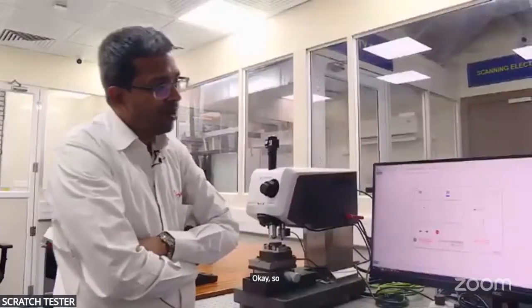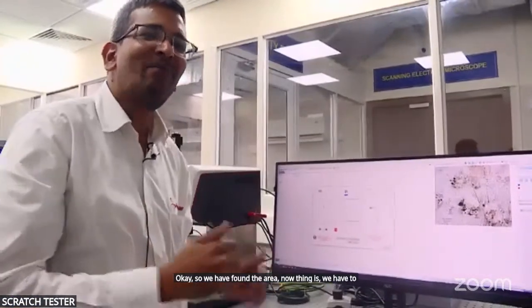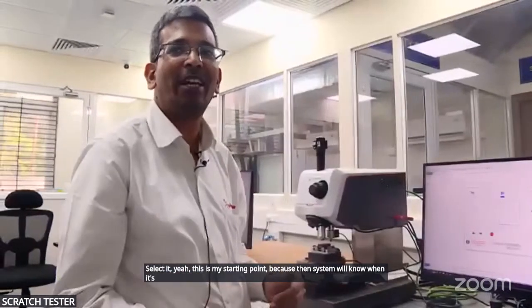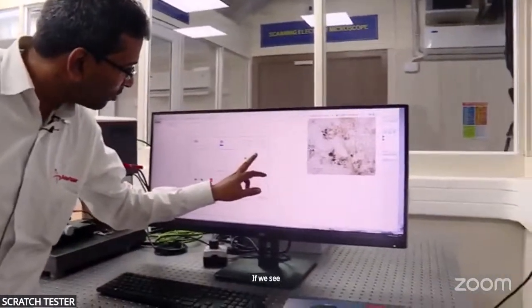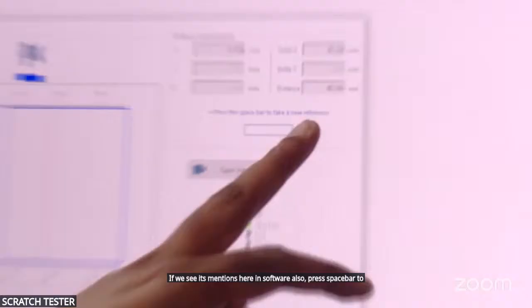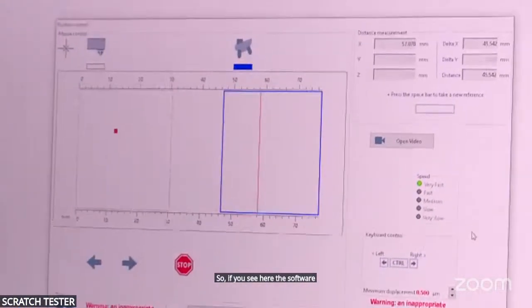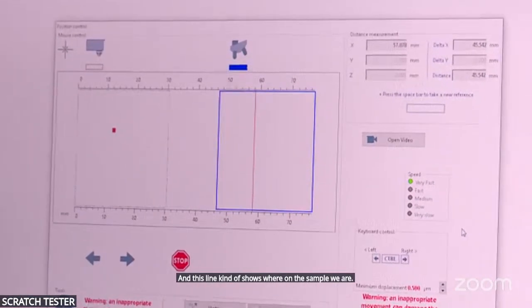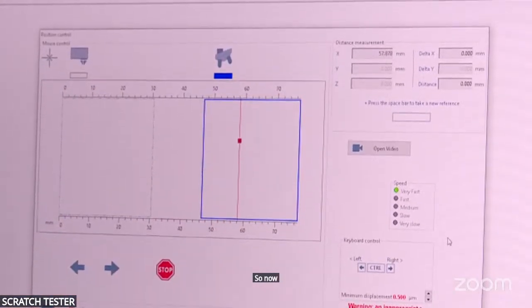Okay, so we have found the area. Now the thing is we have to select it. This is my starting point, because then the system will know, when it's taking the panoramic image, from where to start. To select the area, it mentions here in the software also, press spacebar to take a new reference. We have a red dot and this red line kind of shows where on the sample we are. If I press yes, you can see the dot has moved. So now my reference is set.